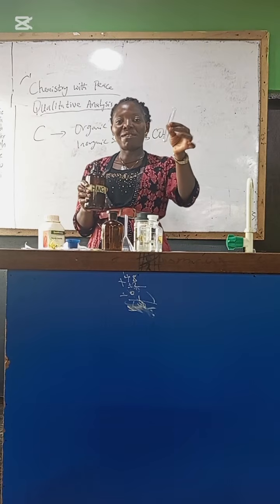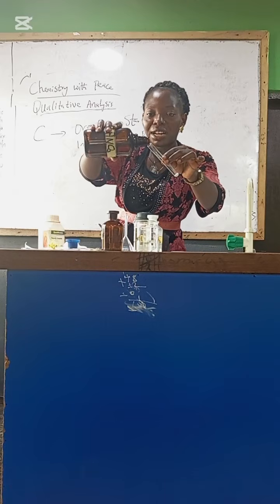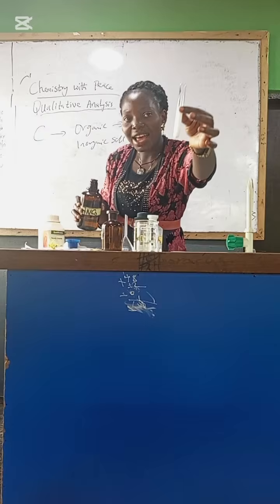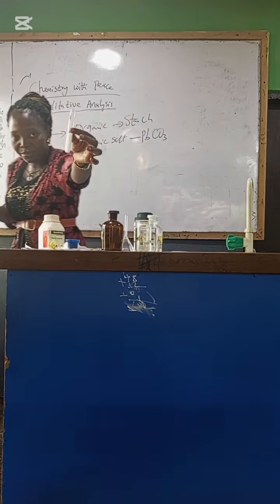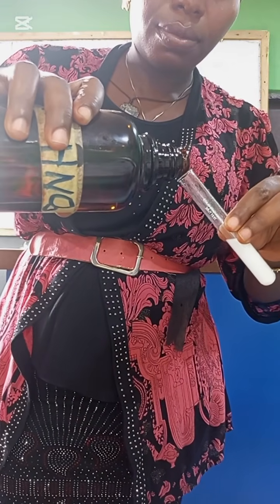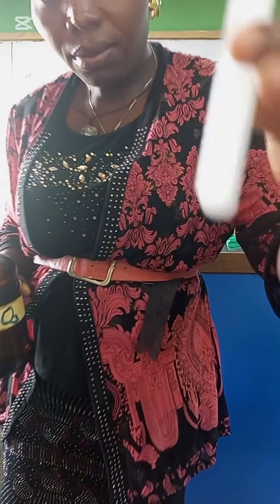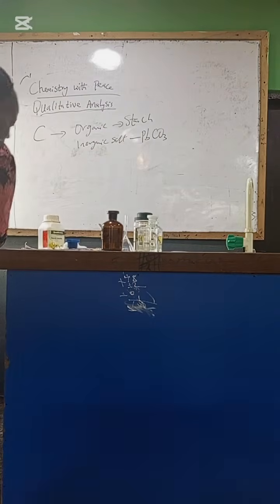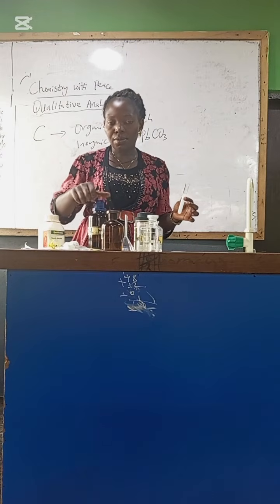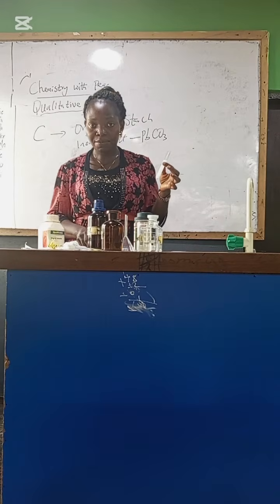I want you to observe what will happen on addition of dilute trioxonitrate(V) acid. Effervescence occurs, indicating that there is presence of carbon(IV) oxide in it.